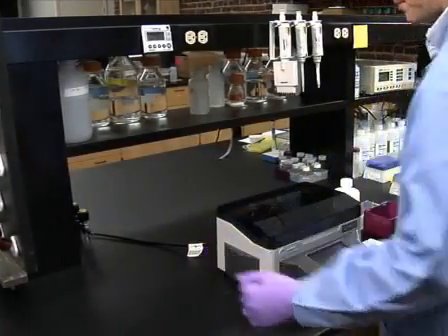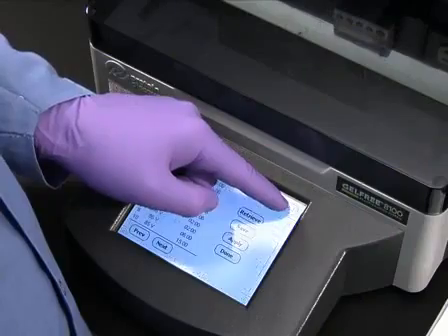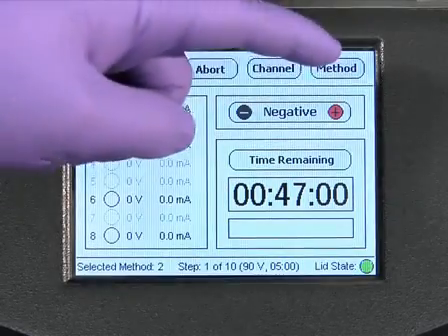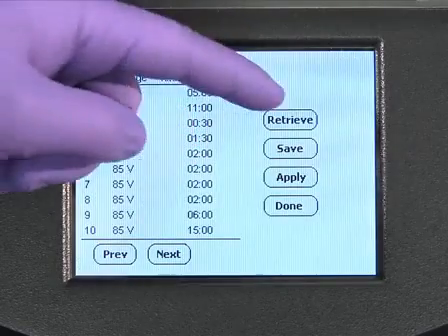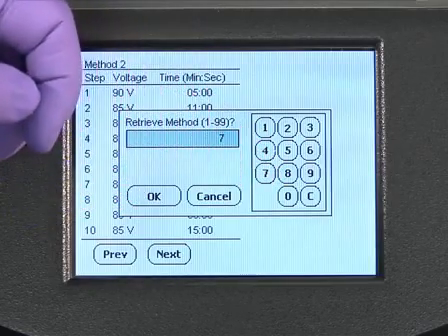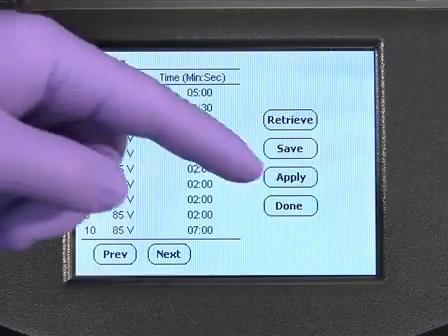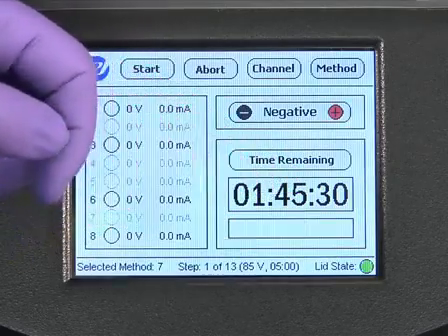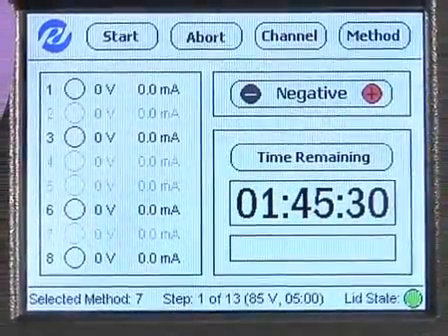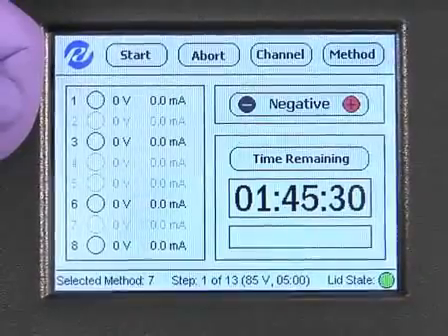Using the easy-to-program graphical user interface on the instrument's touch screen display, go to the list of available pre-programmed methods. Select the appropriate method by pressing the method button. Press the retrieve button and enter the number of the desired pre-programmed method using the on-screen keypad. Press OK, then press the apply button. The method that has been applied will appear at the bottom of the main screen. Each of the pre-programmed methods consists of set voltages and time-based pauses designed to resolve proteins within a specific range of molecular weights.